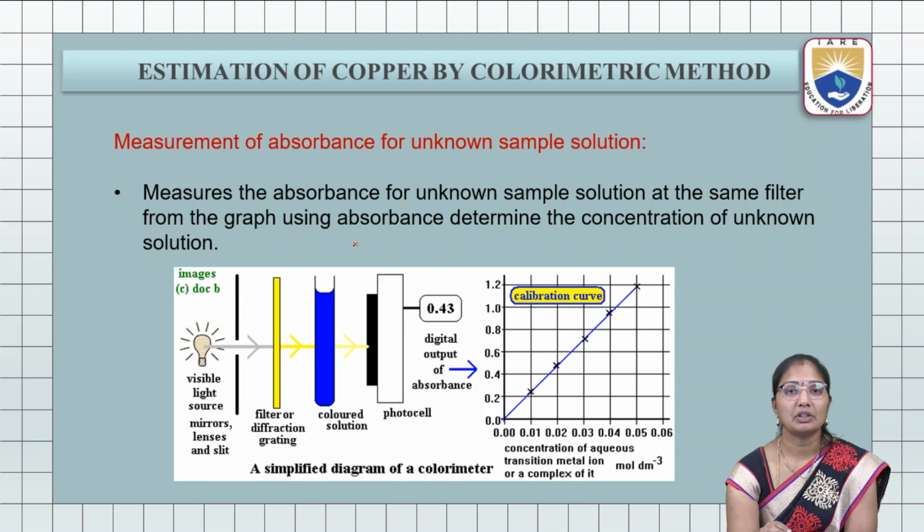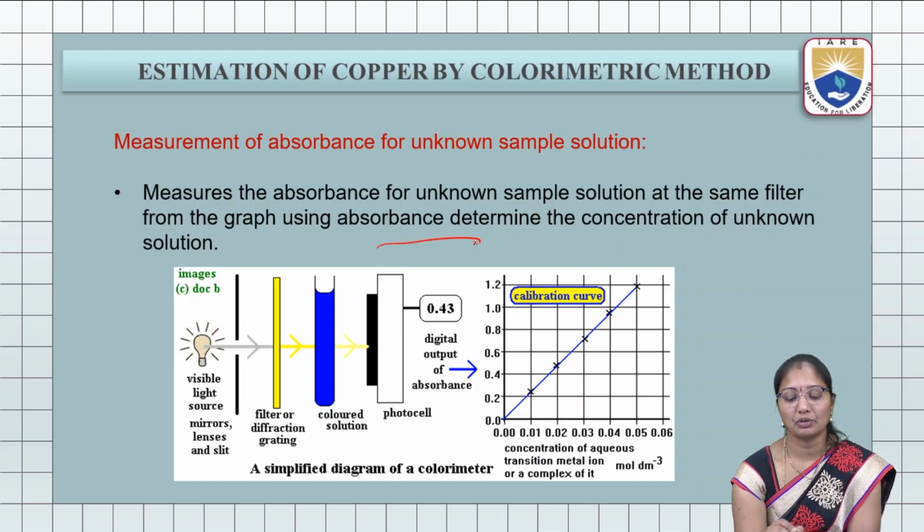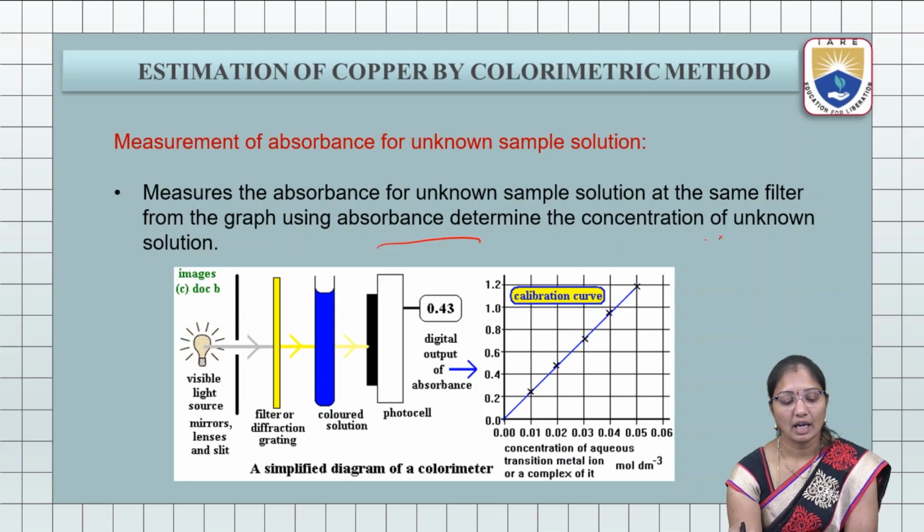Then the measurement of absorbance of the unknown solution. It measures the absorbance of the unknown solution at the same filter, and using the graph of absorbance it determines the unknown concentration. Here, the theory which we have seen is shown as a pictorial representation of all the theory we have covered.